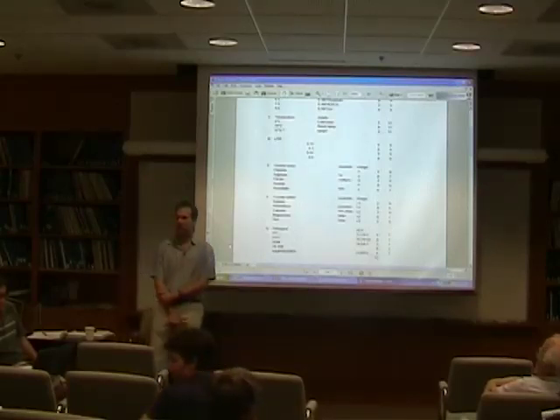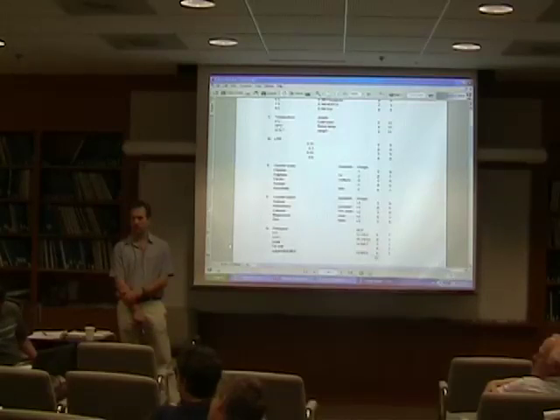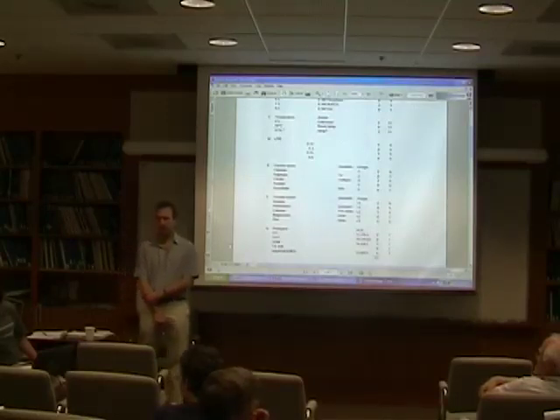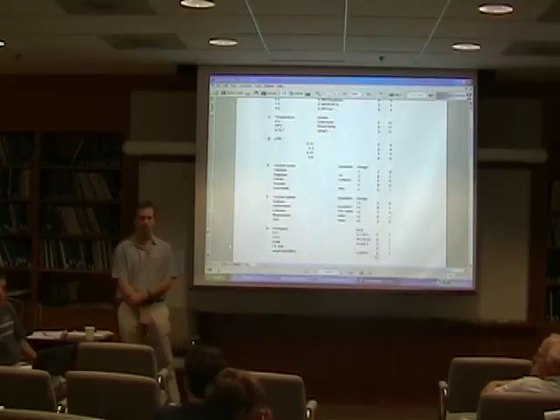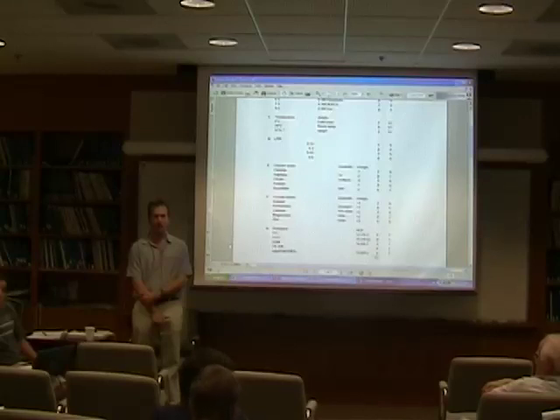But there is a difference between what Ian said and what you say. What you say is centrifugation in one concentration of sucrose. It's not a gradient, as you mentioned. What you mentioned is a step-by-step sucrose centrifugation. No, I made a step gradient, so it was like two or three steps. You take one extreme and then whatever, not water but 20%. Yeah, 60%, 20 and 10%.